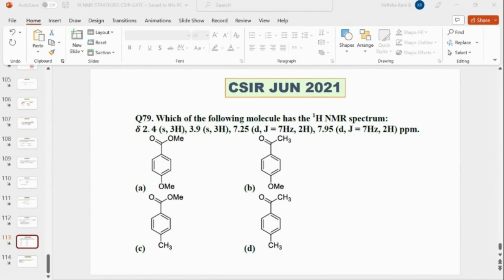Okay, so இப்ப சொல்லுங்க பாப்போம். OMe is electron donating group ma'am, so there will be shielded ma'am. Okay. So two different regions are created here ma'am in benzene. இதுலயும் அப்படிதான் இருக்கு. இதுல COCH3 இருக்கு. You have ester here, you have a methyl here. இங்க you have a ketone and you have a O methoxy. அதனால என்ன? ஒரு பக்கம் பிளஸ் ஆ இருக்கு, இன்னொரு பக்கம் மைனஸ் ஆ இருக்கு.